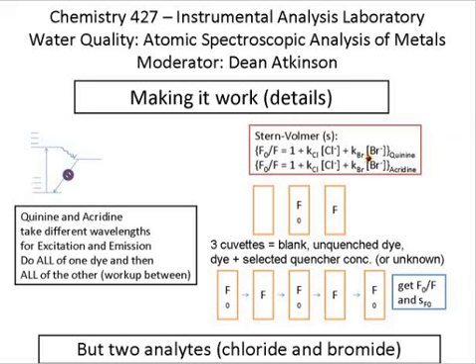Basically what you're going to have to do is either do some kind of a substitution, make one equation, cancel out one of the unknowns from one equation and substitute back into the other equation, or some kind of a matrix solution. In either case, what you're going to end up with for the answers are the concentration of chloride and bromide for the 2 challenge samples, for the 2 concentrations of challenge samples, and then work your way back to the concentration or the composition of the solid.